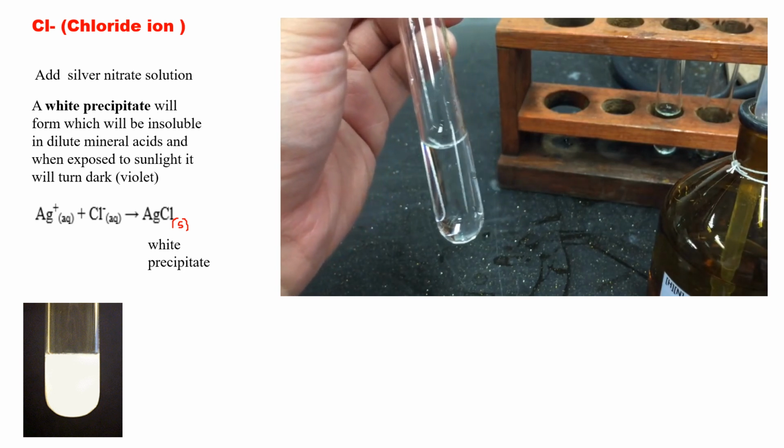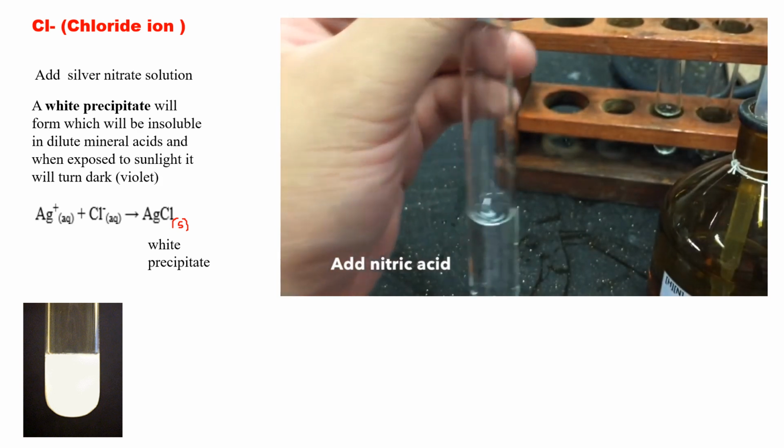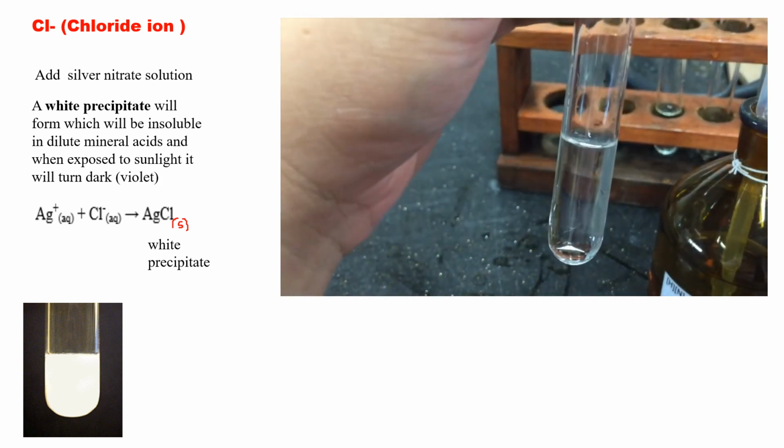To a small volume, add an equal amount of nitric acid.